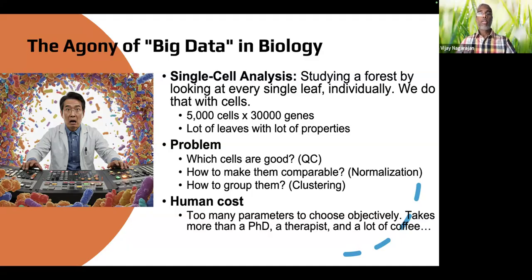Really cool stuff. But you also have multi-omics data, where you have not only gene expression, but also surface-specific proteins, like cell surface proteins. Another very routinely done assay in single cell is to include chromatin-level information, like ATAC. So combining these things, now imagine not only the modalities, but also the analyses that you can perform, like the trajectory analysis or the pathway and enrichment analysis. It gets really complicated.